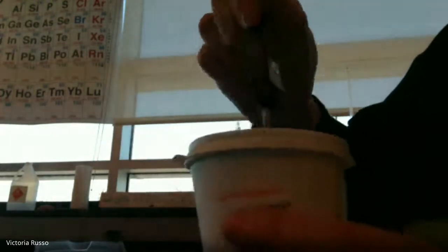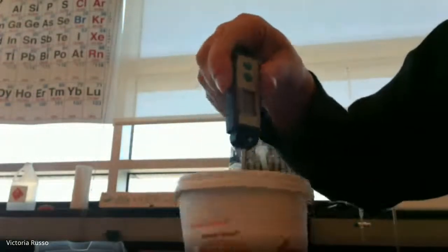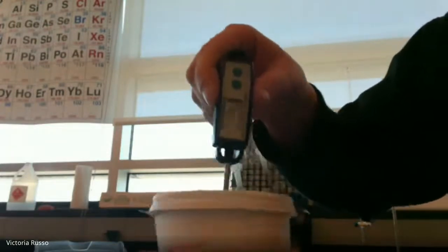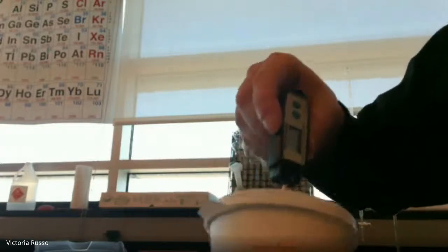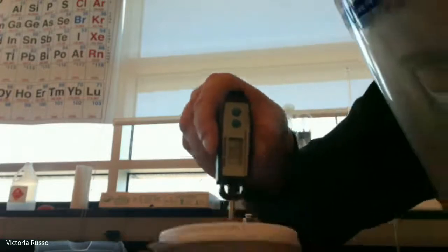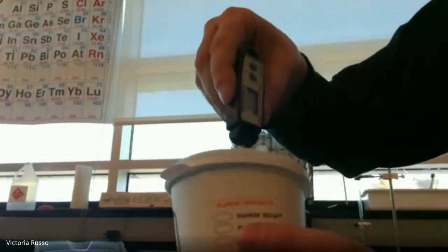And we want to stir a little bit so that the reaction occurs. 25. And I'm shaking it so that the reaction occurs. 27, 28. Stirring and shaking so that the reaction occurs. 30. 31. We're at 32. And again, the reaction is occurring inside the cup, hopefully keeping the heat in.